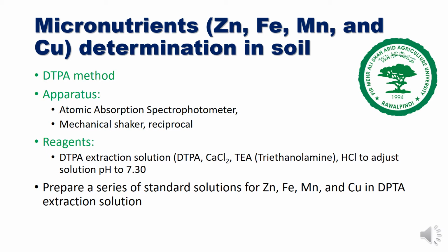We will mix all these reagents and we need to adjust their pH exactly to 7.3 with 6 normal HCl.